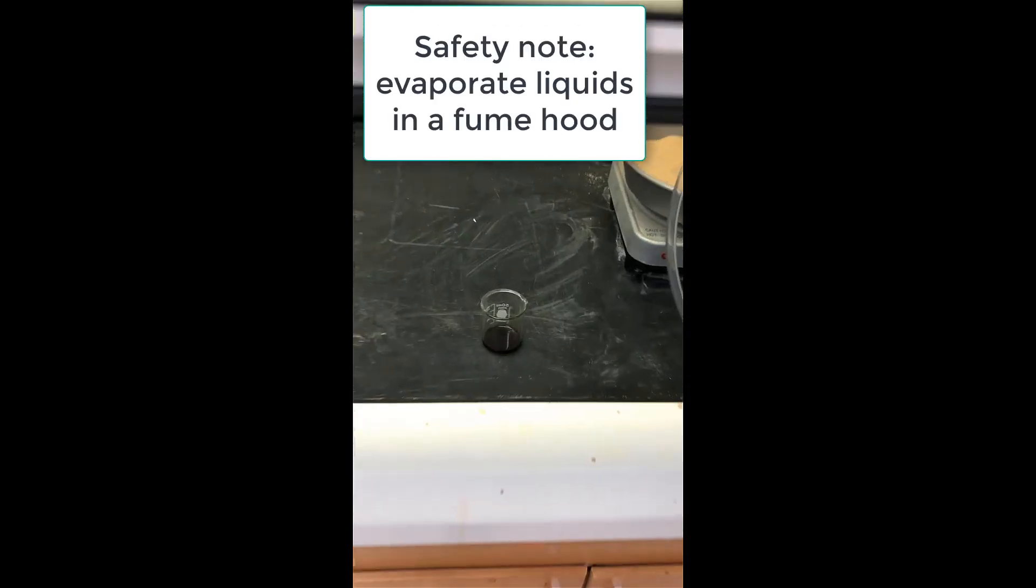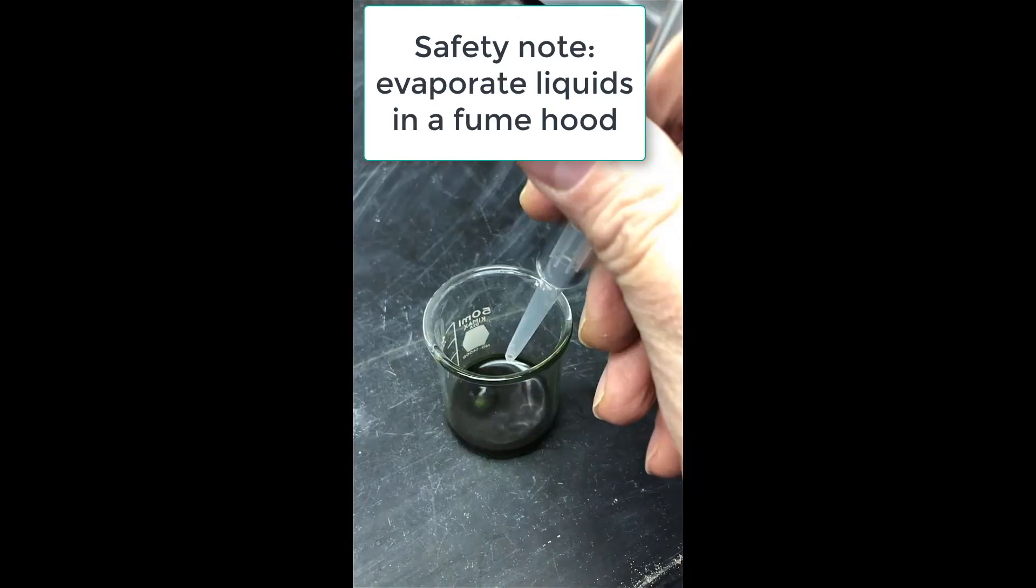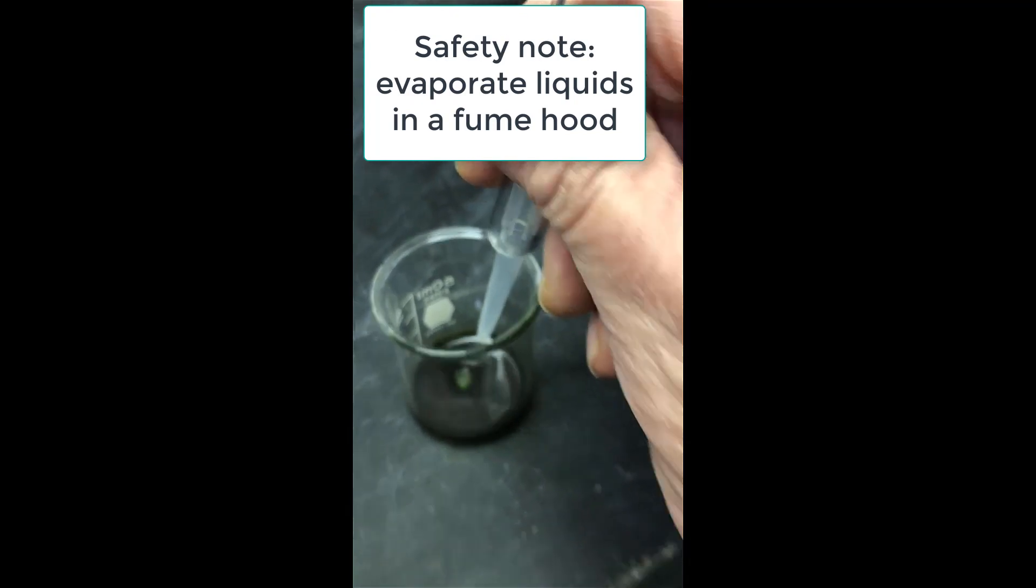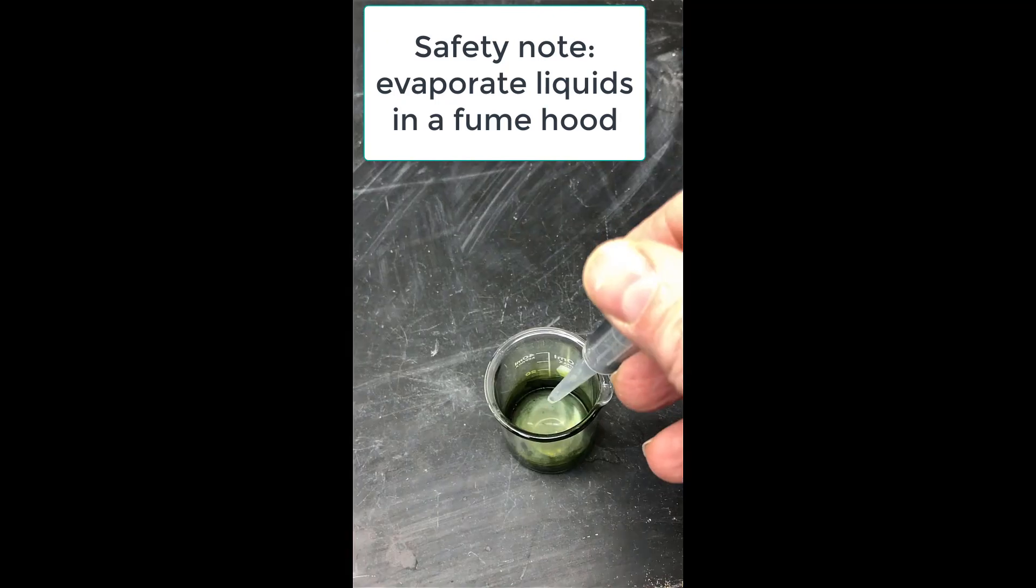Now we need to remove solvent, so we're going to do that in a fume hood. Use a gentle stream of compressed air to blow into the flask to remove the solvent until it is completely gone and you have a green residue.